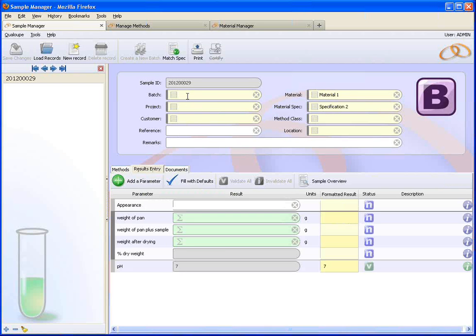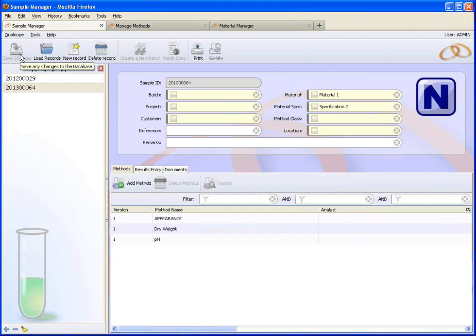you could have put in batch, customer reference. You could have spent a bit of time filling all of this in. So we've also got an option in here to make a duplicate of a sample. If I duplicate the sample, it doesn't give it a new name with brackets because obviously we've already got a unique naming / numbering convention for your sample, which is the sample ID, so it's just allocated it the next available sample ID. So I think I've probably shown you enough about this.